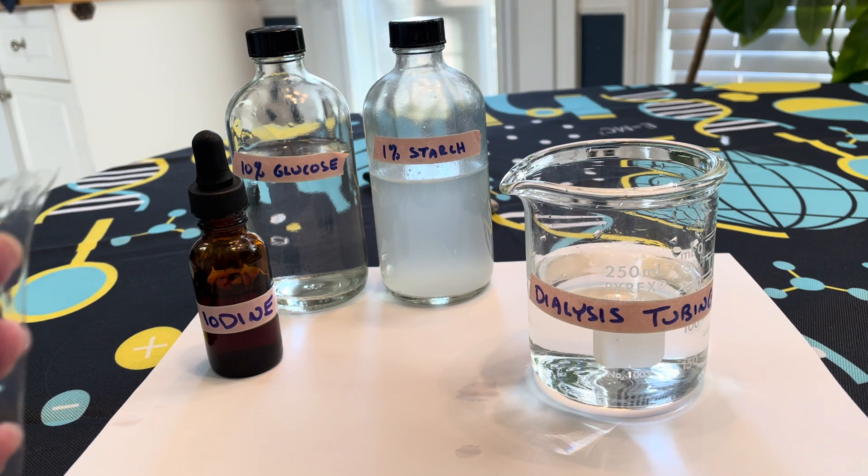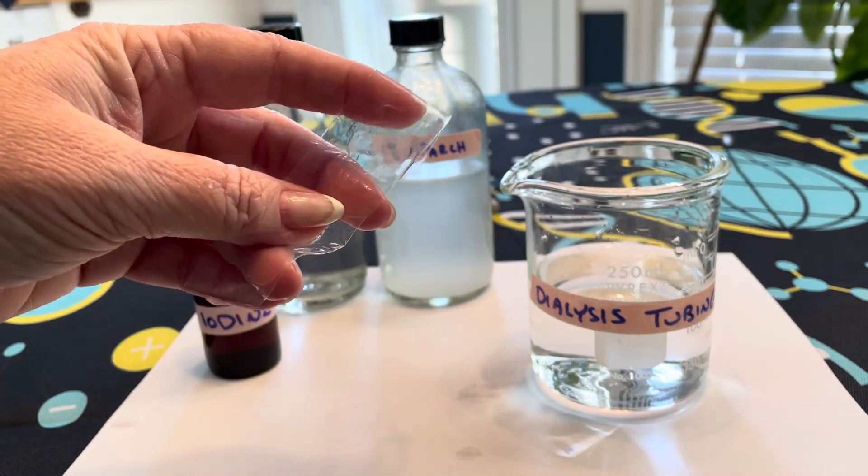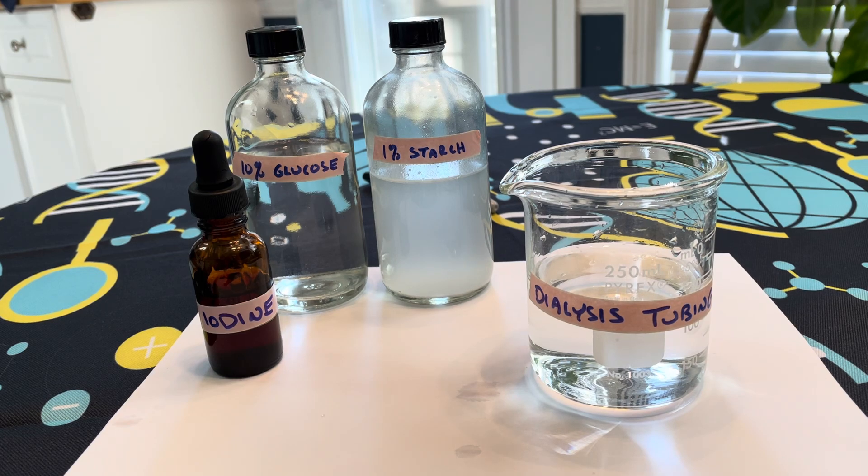This is going to involve a piece of equipment called dialysis tubing. Dialysis tubing is a thin plastic material, and it's going to simulate the semi-permeable membrane of our cells.